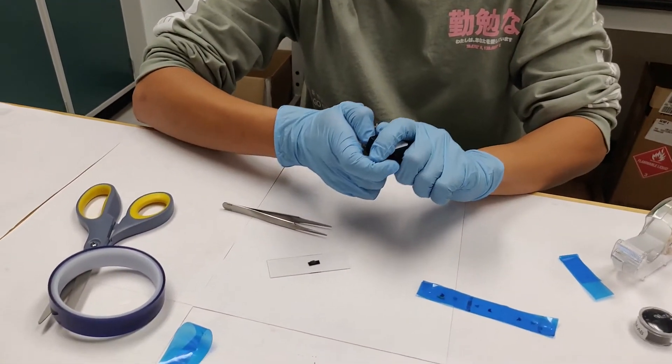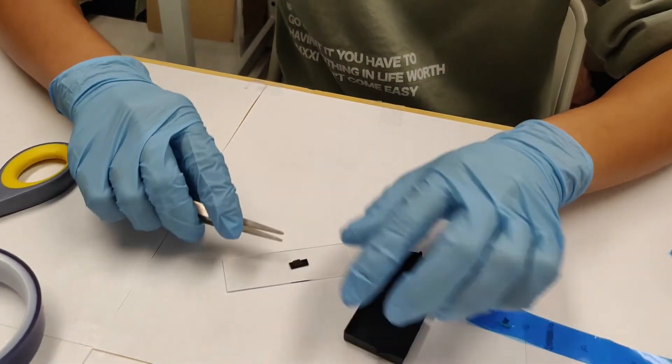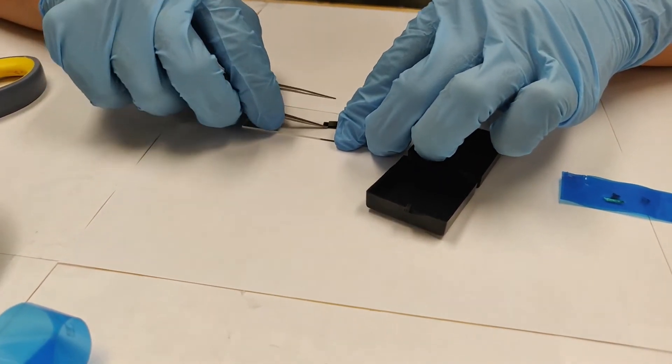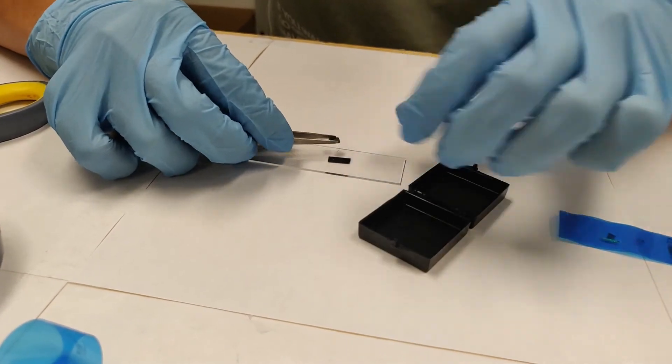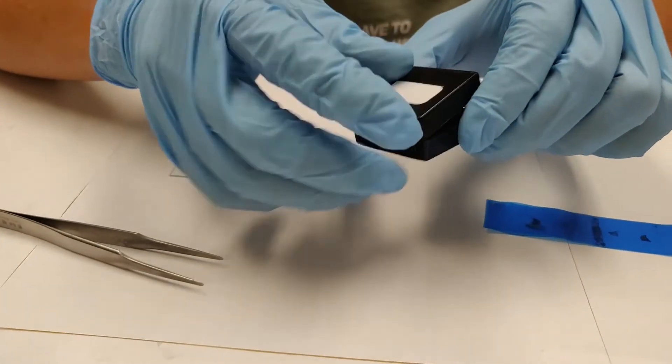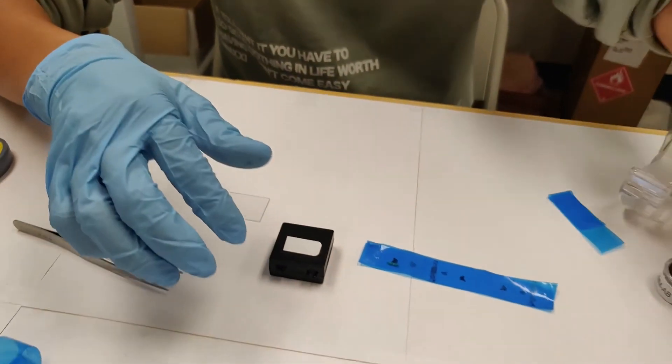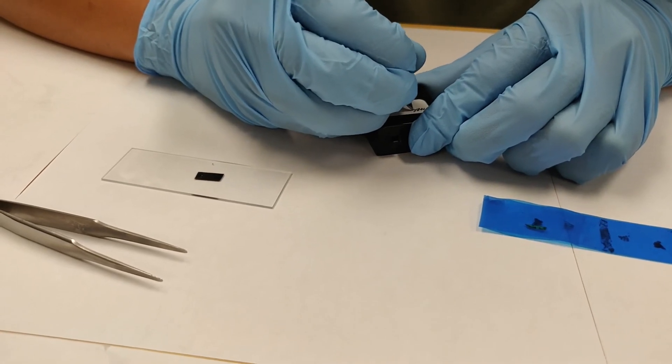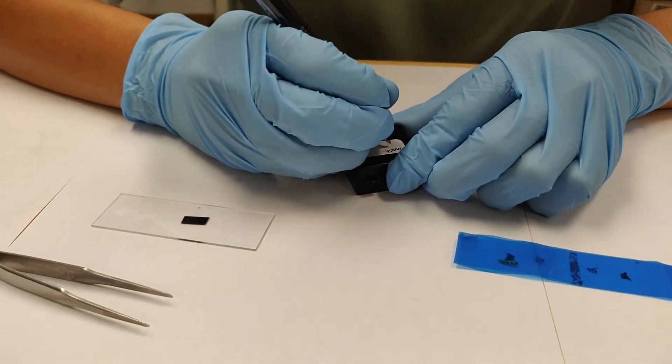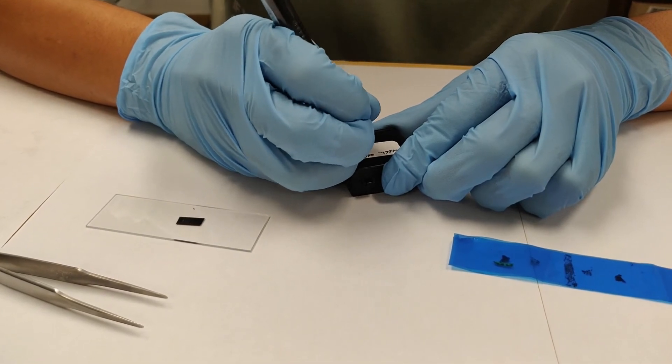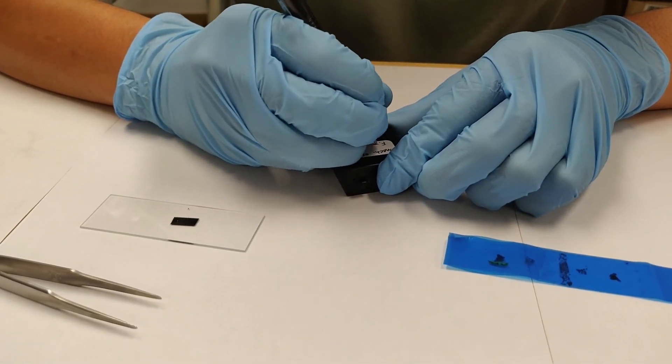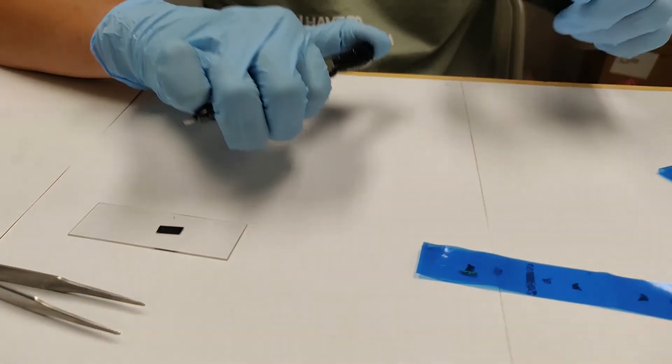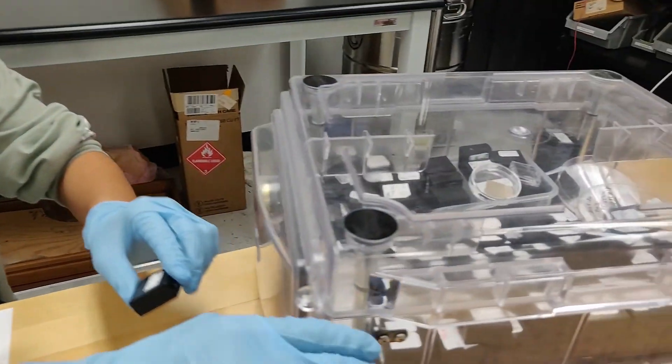But to store it away, you want to put it in a box. Remove it from the tape. Place it in the box. Then you will label the box. And then you place it in the desiccator so it doesn't oxidize.